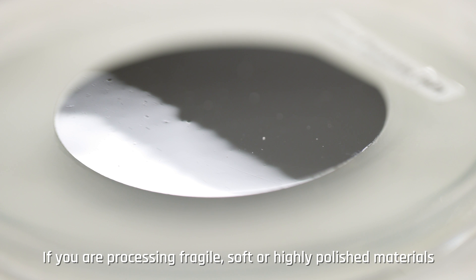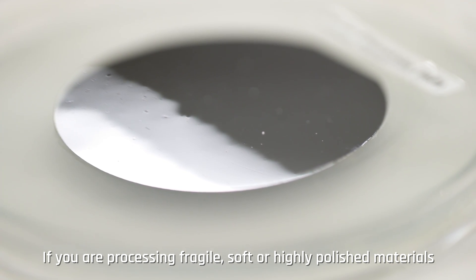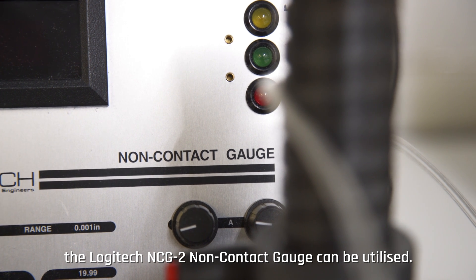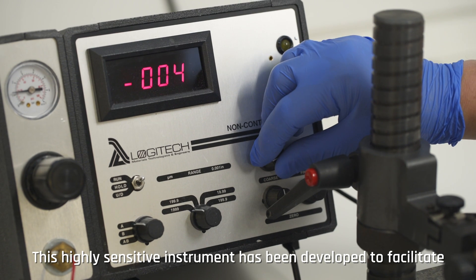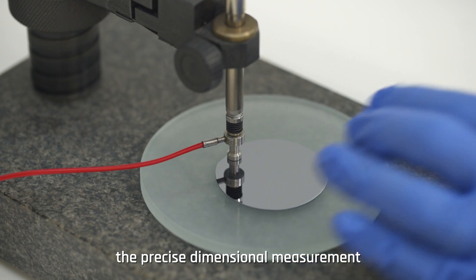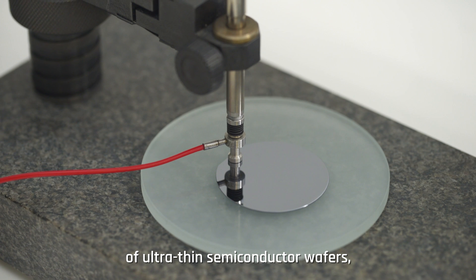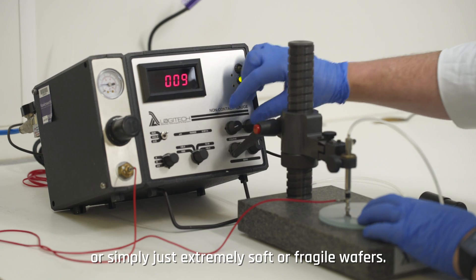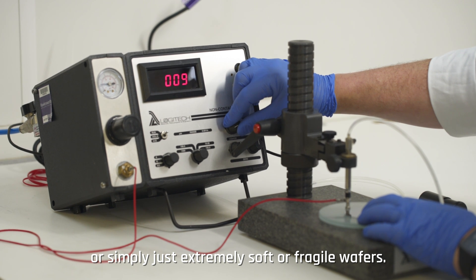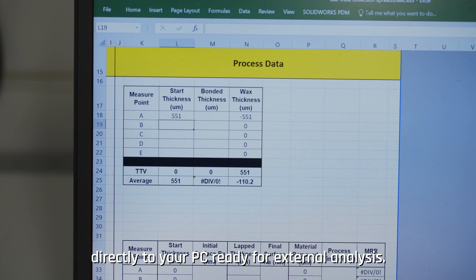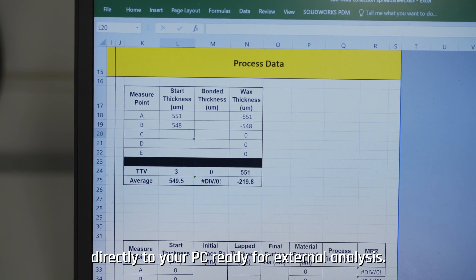If you are processing fragile, softer, highly polished materials, the Logitech NCG2 non-contact gauge can be utilized. This highly sensitive instrument has been developed to facilitate the precise dimensional measurement of ultra-thin semiconductor wafers, soft organic crystals, high quality optical components, or simply just extremely soft or fragile wafers. Logitech gauges transmit data directly to your PC ready for external analysis.